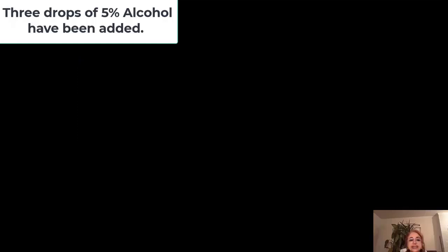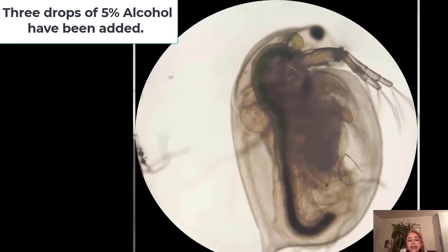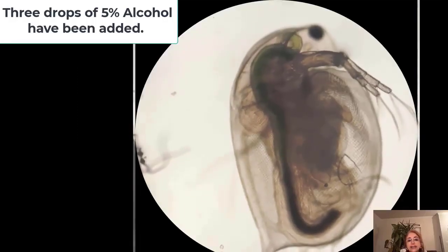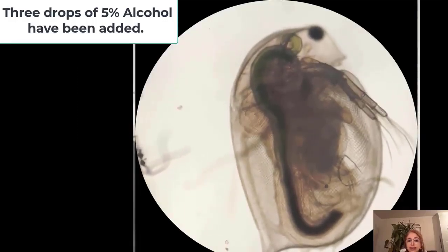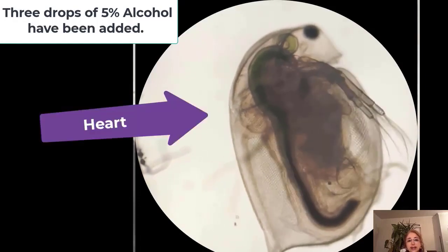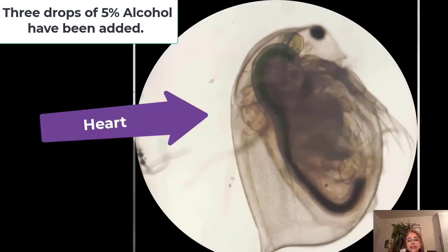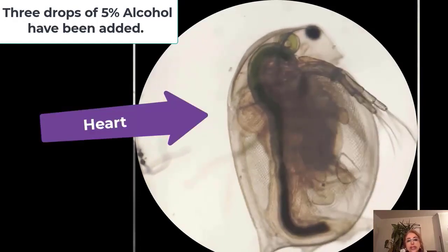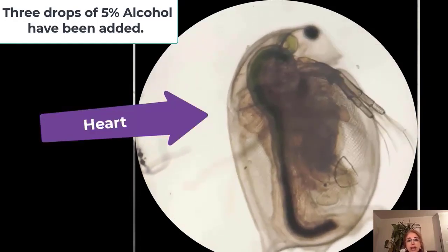3 drops of 5% alcohol have been added to the Daphnia. Start counting the heartbeats once you hear the beep sound.